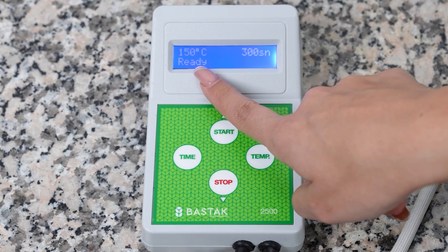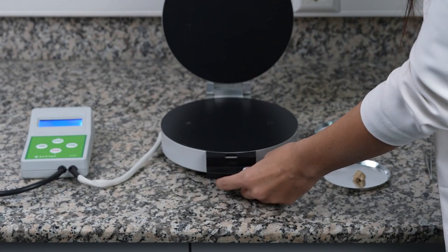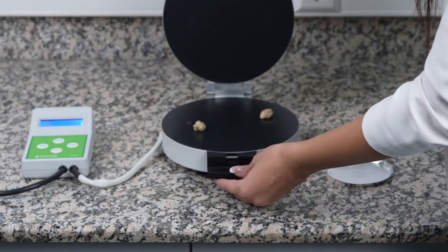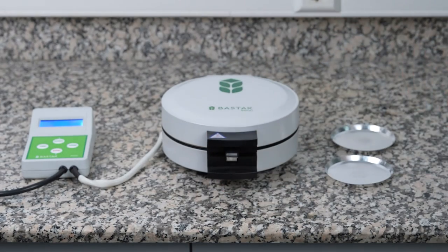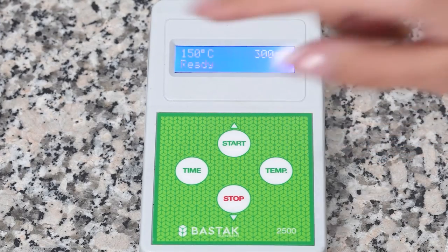The text "ready" appears on the screen and gives an audible warning. Then the upper cover of the device is opened and the wet gluten is placed in the device with the help of a forceps, and the cover is closed. It should be noted that the door lock is fully closed. After the top cover of the device is closed, the device starts the test by pressing the start button and the text "testing" appears on the screen.